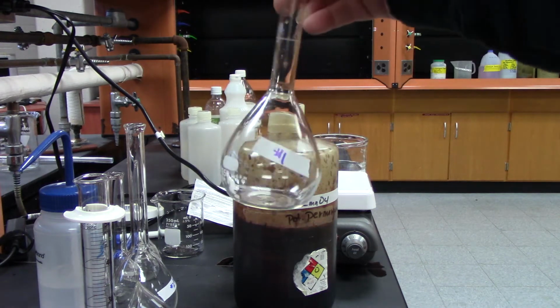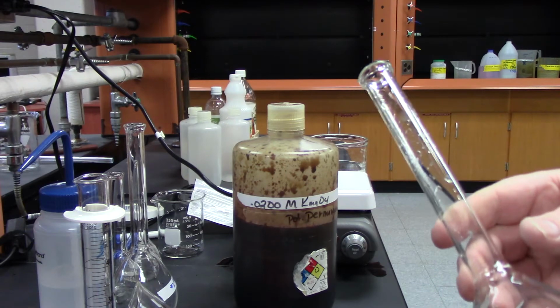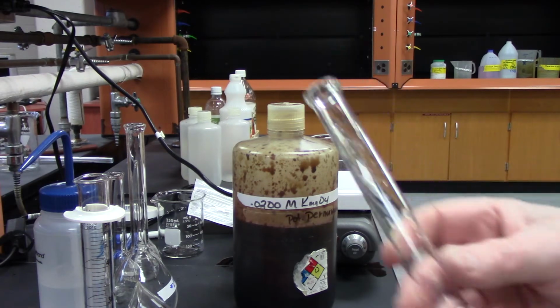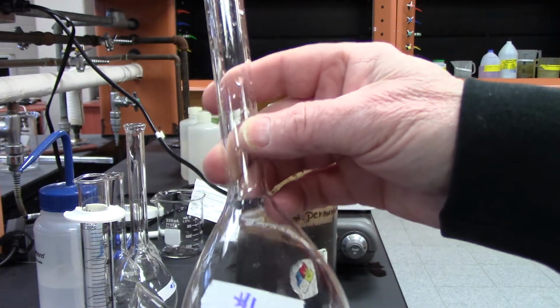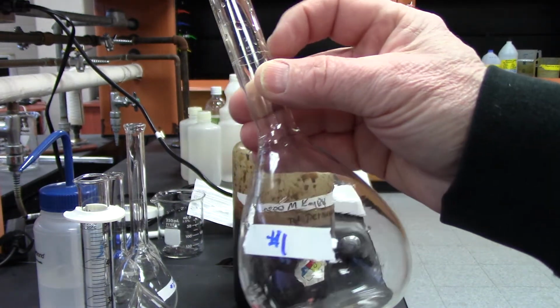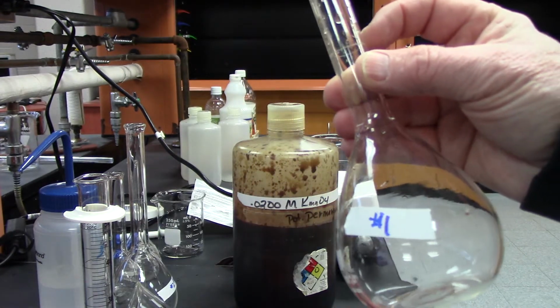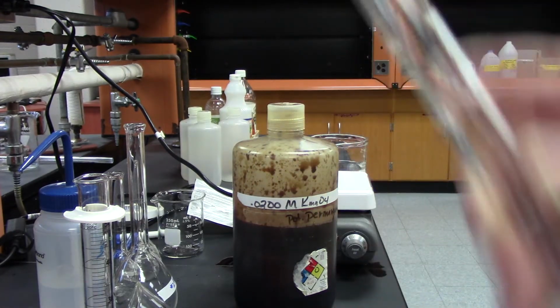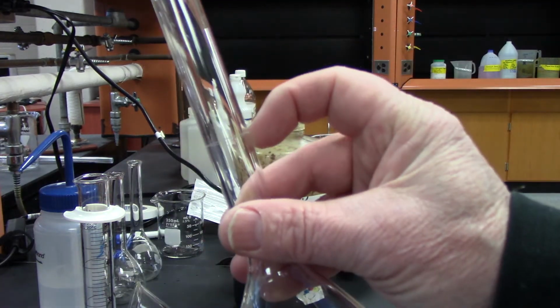this guy. The volumetric flask is a really good tool for measuring precise volumes. So it's got a teardrop shape to it, and you'll notice it has a line right here. Okay, and that's the line that will bring the volume up to. Now, here's another 250. This has its line at a different point.